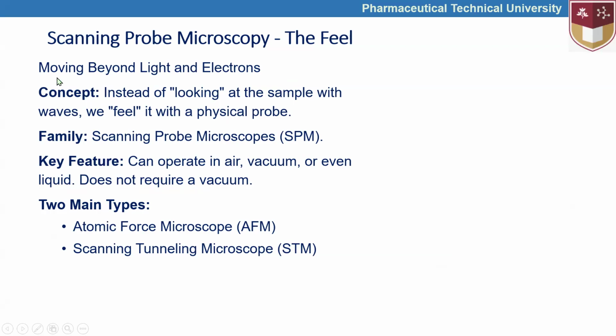Let's say it moves beyond light and electrons. The concept is that instead of looking at the sample with waves, here we feel it with a physical probe approach.